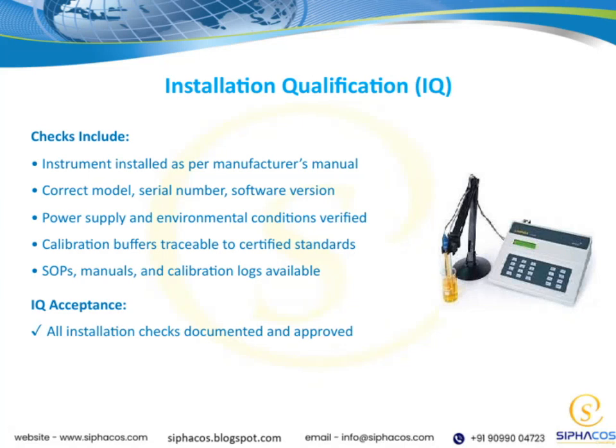Let's talk about installation qualification, or IQ. This is a crucial step to ensure that our instruments are set up correctly from the start. First, we need to verify that the instrument has been installed exactly as outlined in the manufacturer's manual.